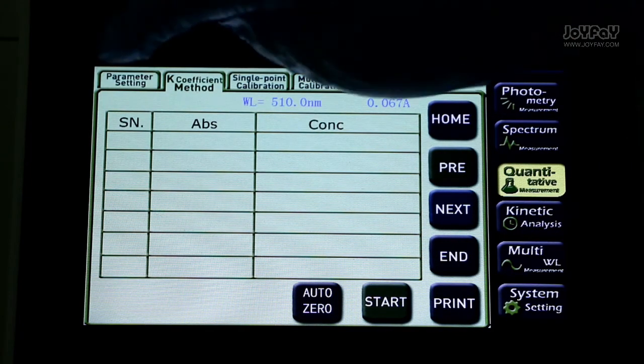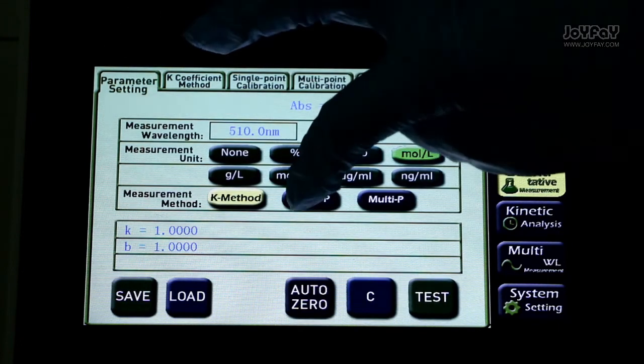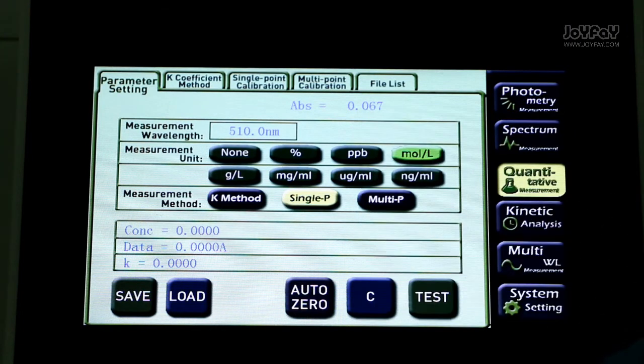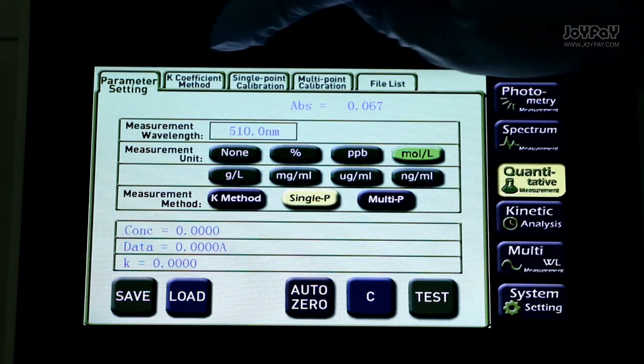If you choose single point method, you need to enter concentration. You can see the result in tag 3.